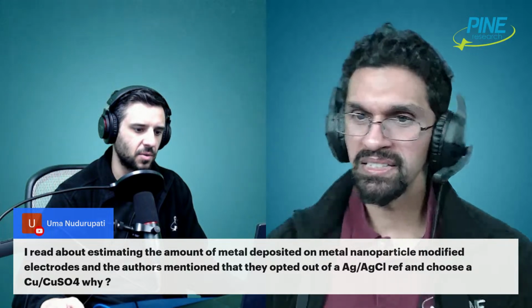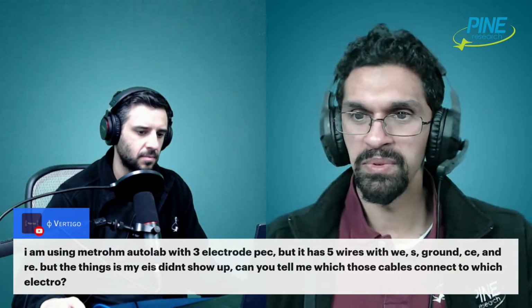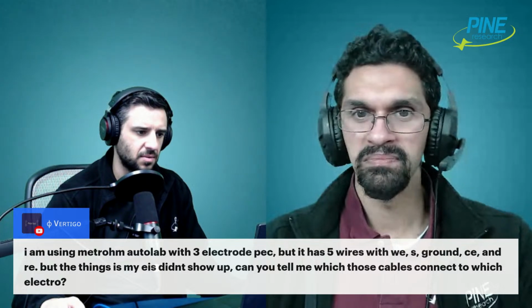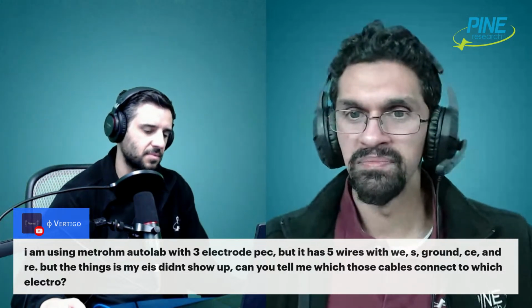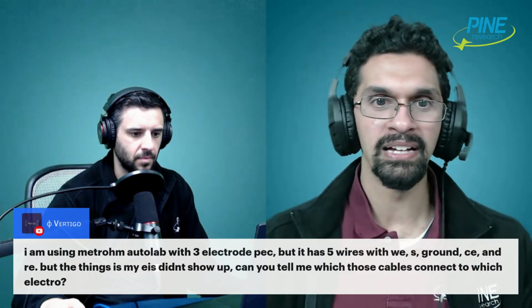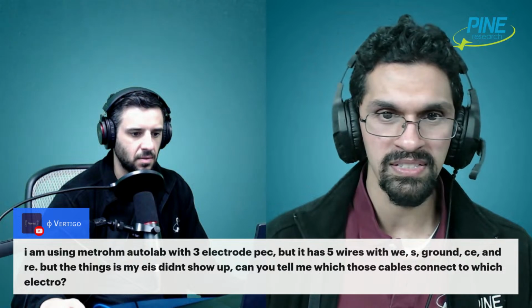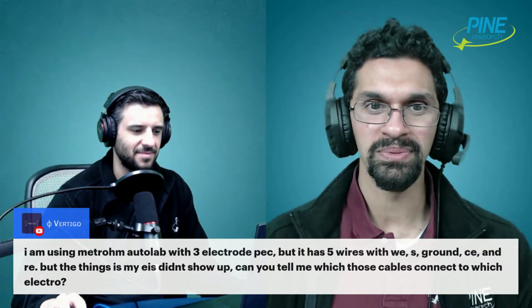But the last question is from Vertigo. Vertigo asks, I'm using a Metrohm Autolab with a 3-electrode photoelectrochemical cell. I'm assuming that's what PEC means. It has 5 wires with WE, S, ground, CE, and RE. But the thing is my EIS didn't show up. Can you tell me which of those cables connect with each electrode?